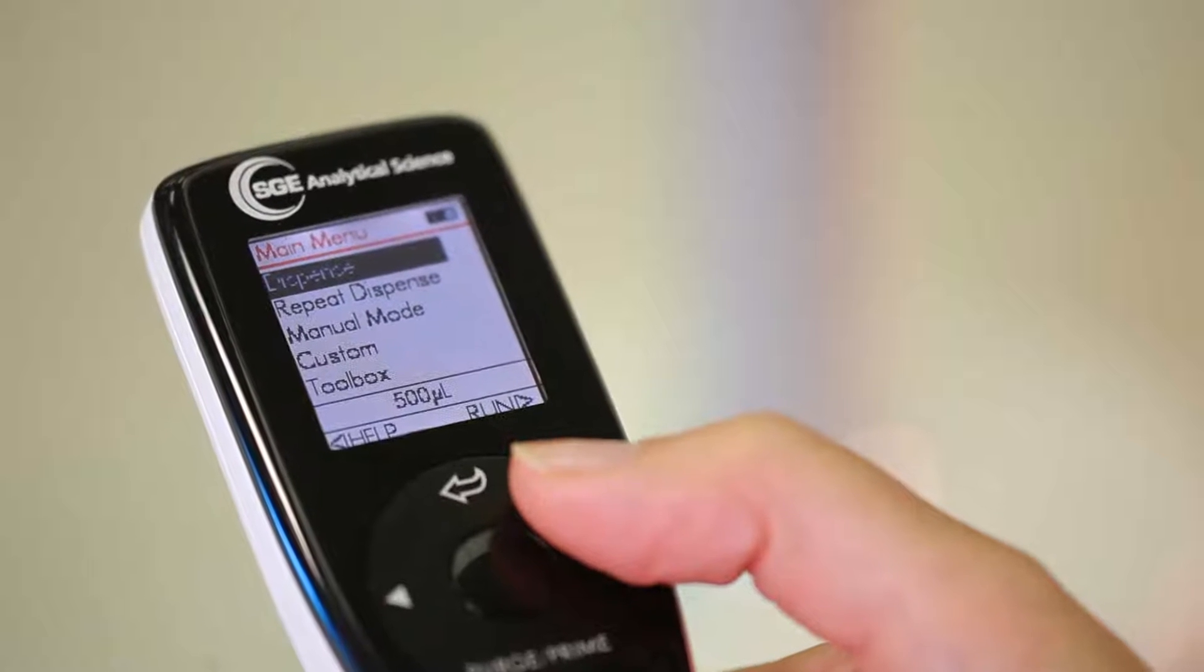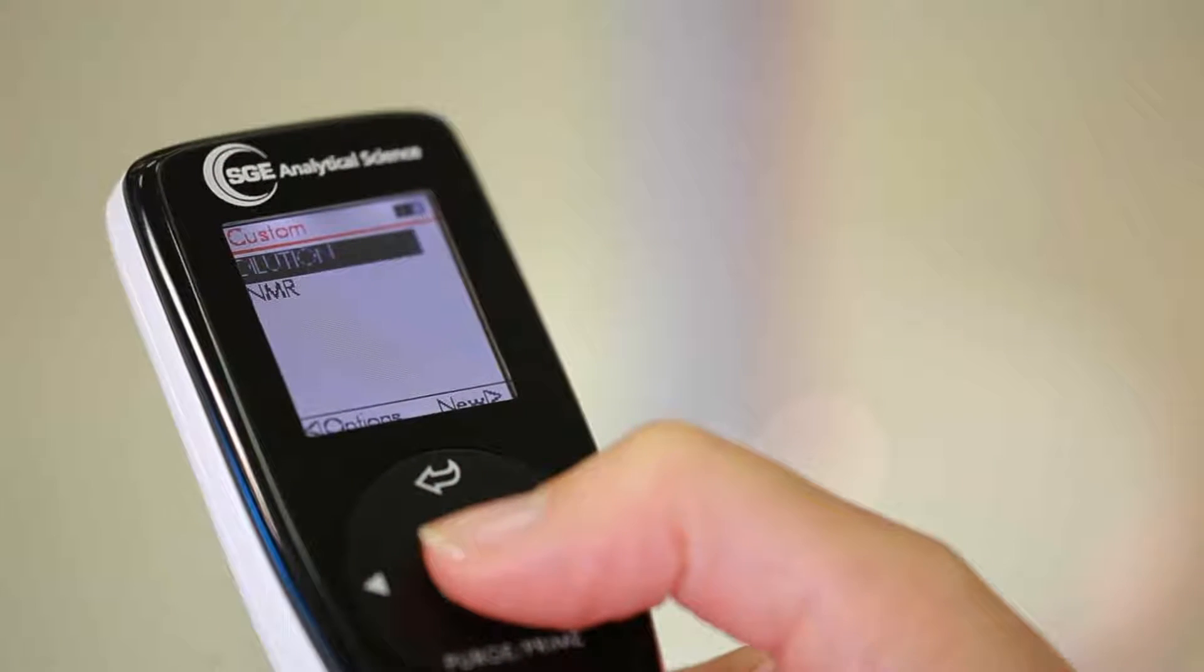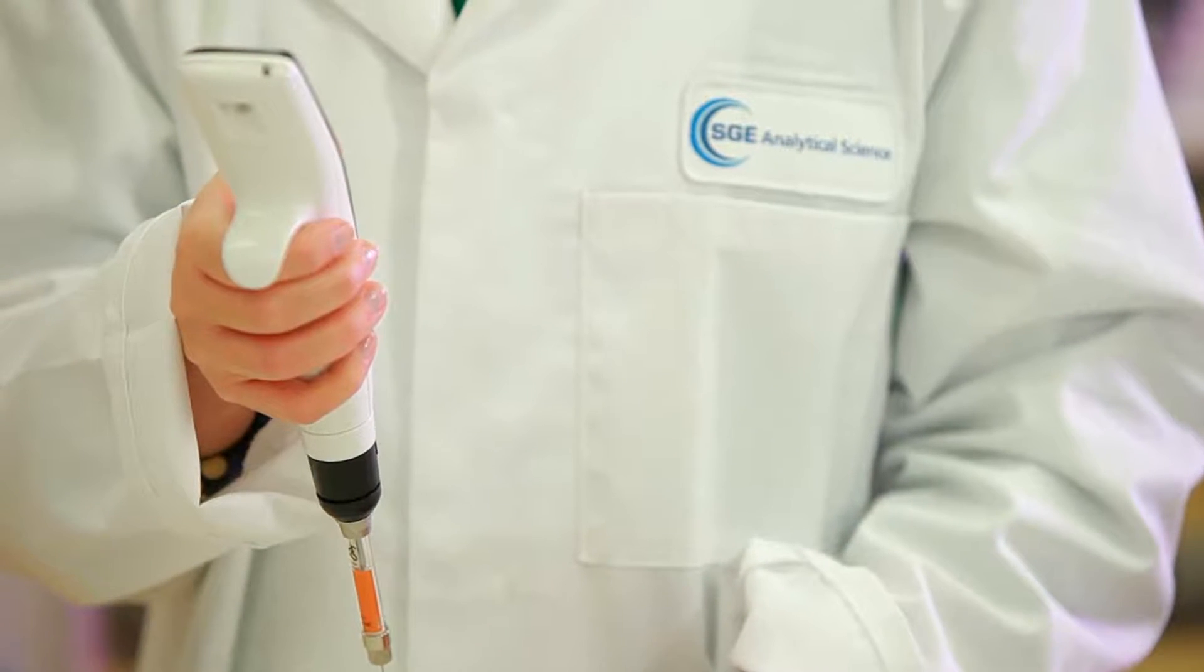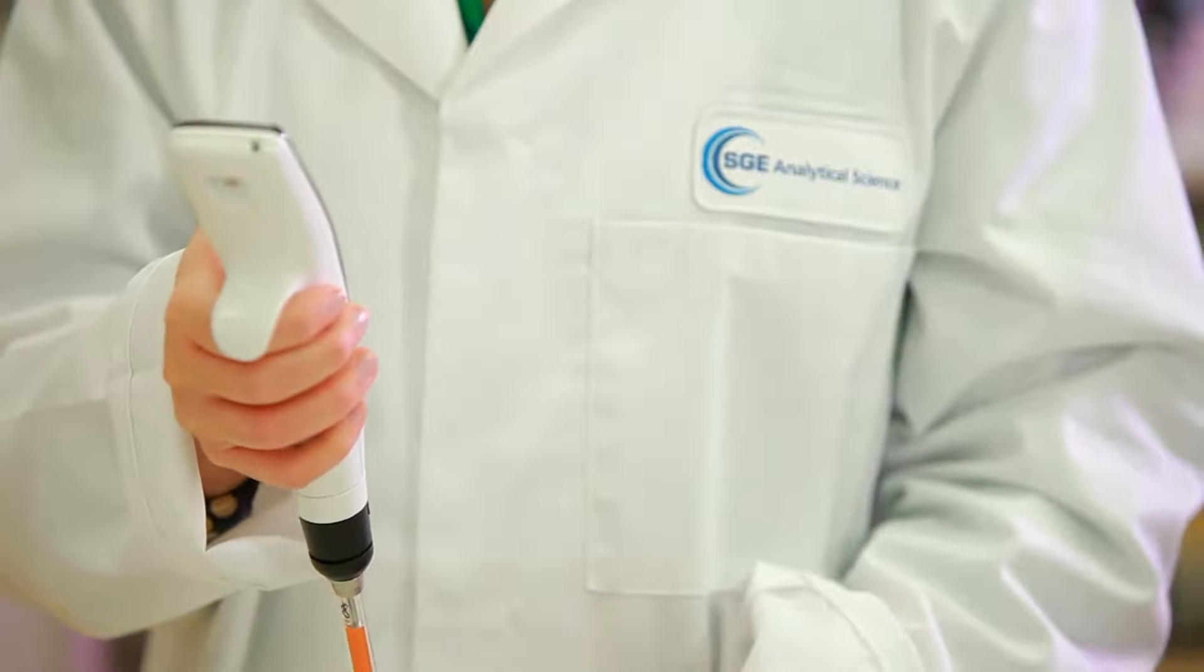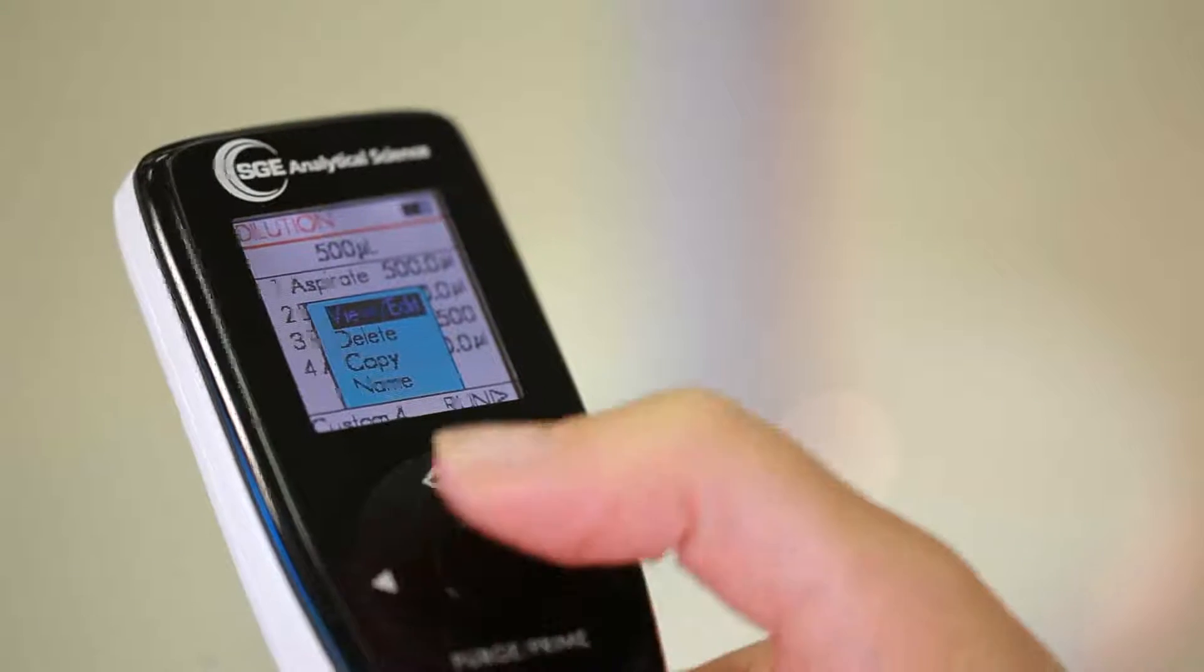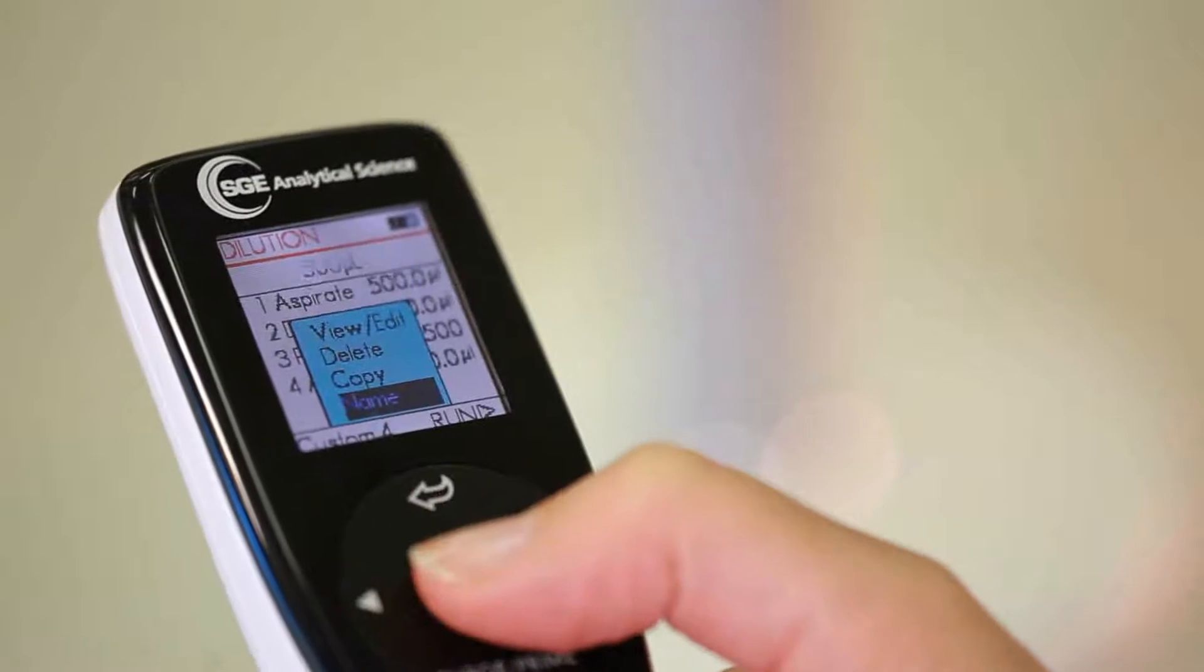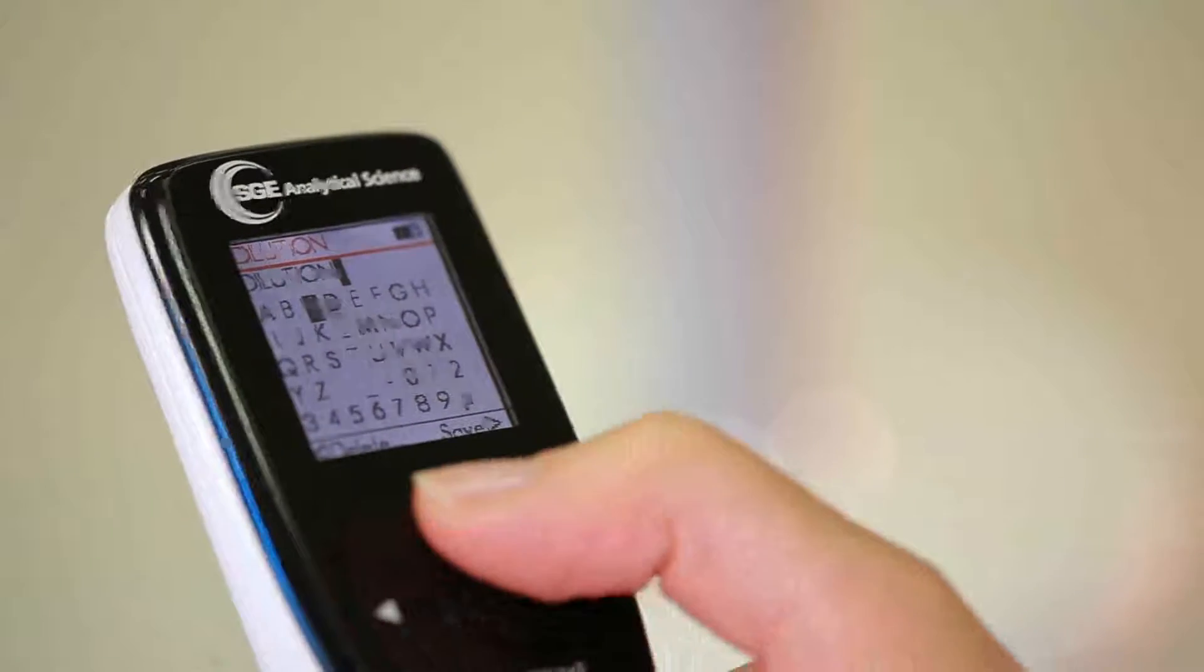To create and save a new custom program, just use the touch wheel to select the custom option from the main menu. Then, it's easy to follow the on-screen prompts to create programs uniquely suited to a variety of tasks. After the custom program is saved, users can name their program by selecting the name option for later identification.